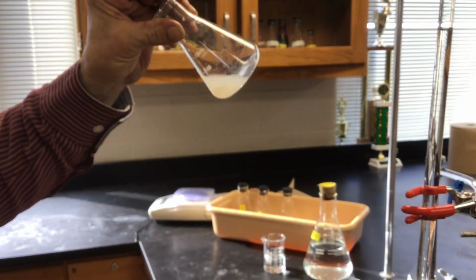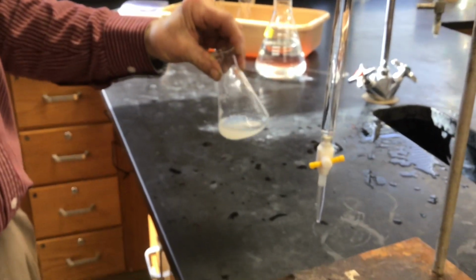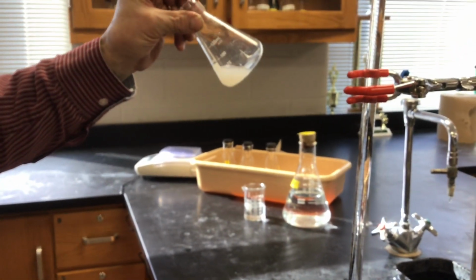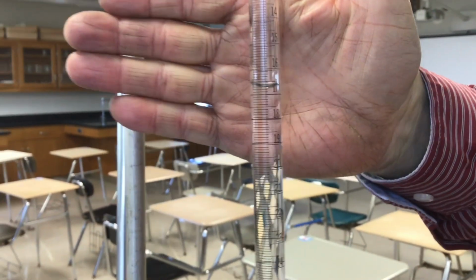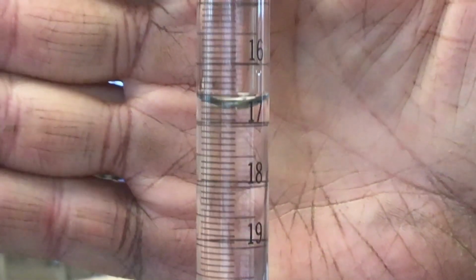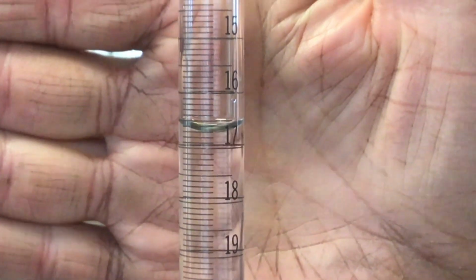What do you think? It's close. I believe that's a little less than we used the first time. But it definitely has a brown tinge to it. Hopefully these are close enough to each other. That's why we have to do at least 2 trials and take an average, because the endpoint is not exact. All right. So we can determine that silver concentration.